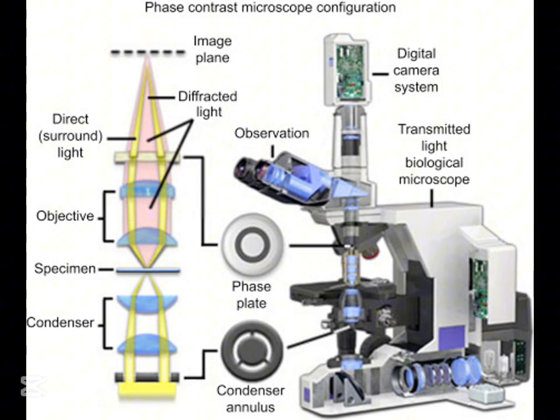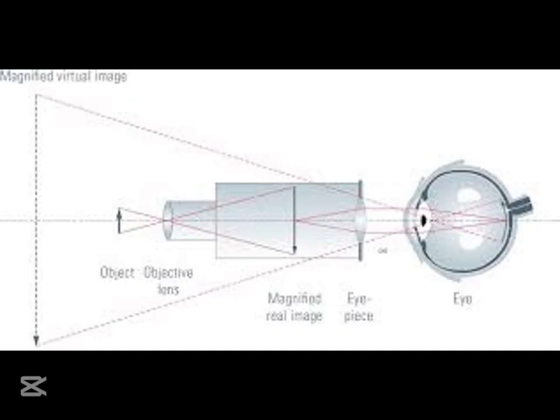Definitely. So how does it actually work? Is it like shrink us down or something? No, not quite. Microscopes use lenses, like a magnifying glass. Sort of, but way more powerful. These lenses bend light to make things look way bigger, hundreds or even thousands of times bigger.